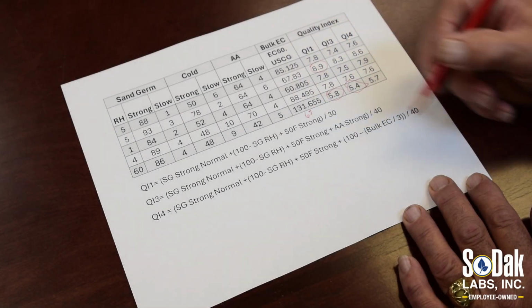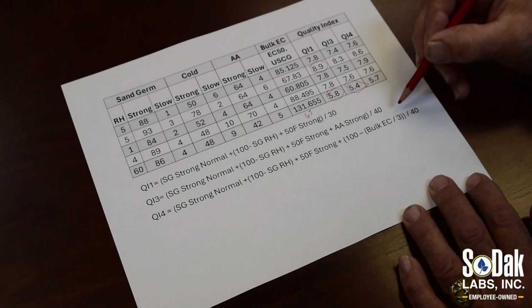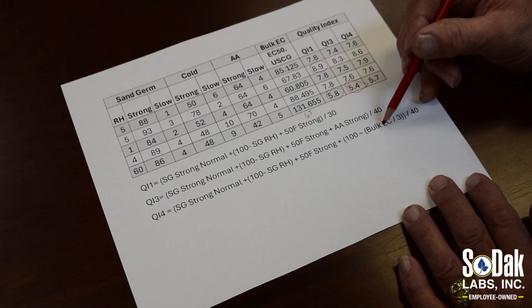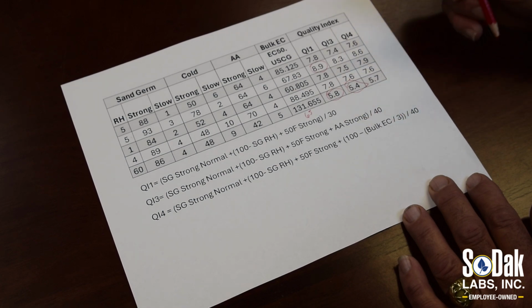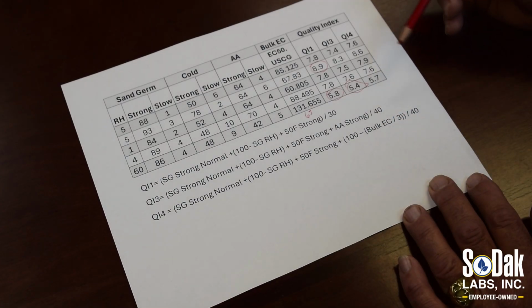So we said 65 is 80%. That's acceptable. So then we ended up using a denominator of 3, dividing the actual microsiemens per centimeter per gram by 3, then subtracting it from 100. So that's how we handled bulk EC in the equation.